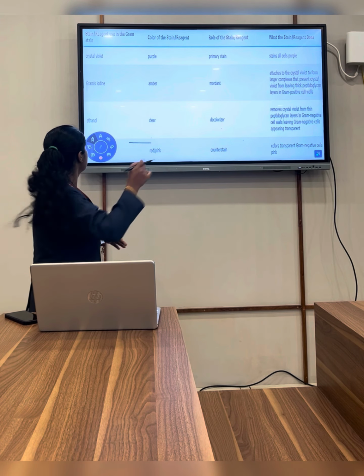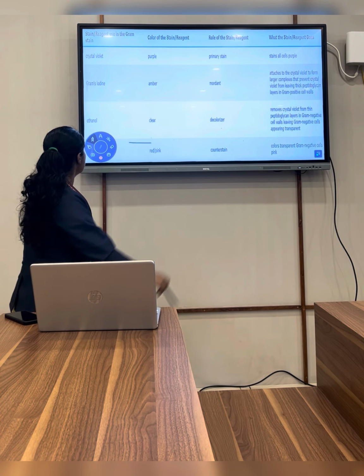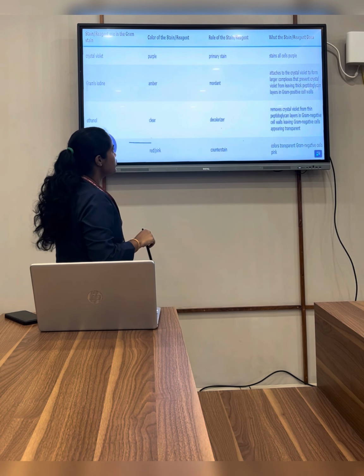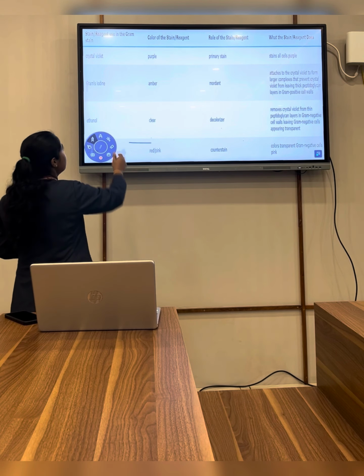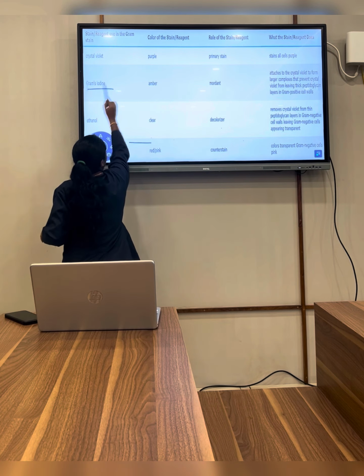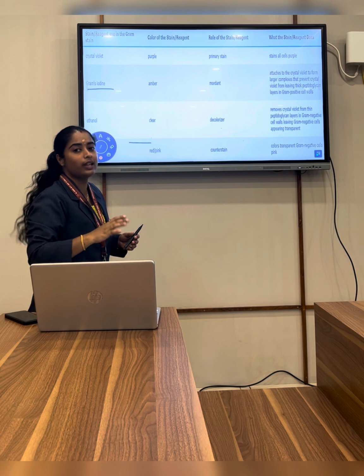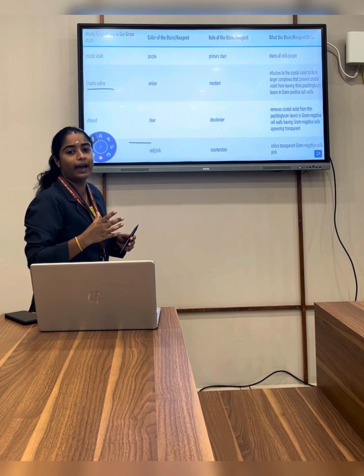When we go through the principle or mechanism behind the Gram staining procedure, first we use purple colored crystal violet as the primary stain. All cells become purple in color. Then we apply the amber colored Gram's iodine, the mordant. It attaches to the primary stain crystal violet and forms a large complex that is called the CVI complex.